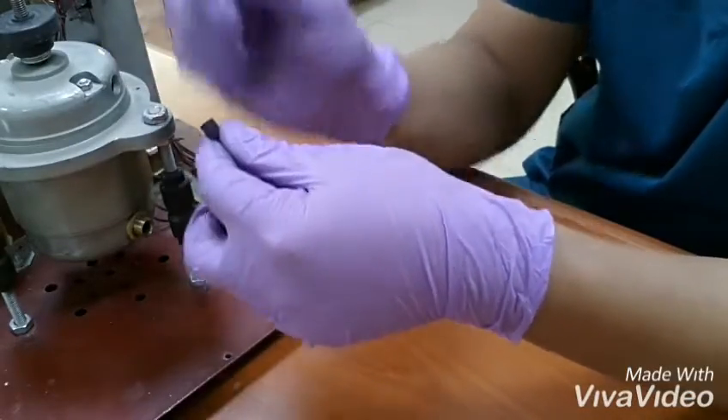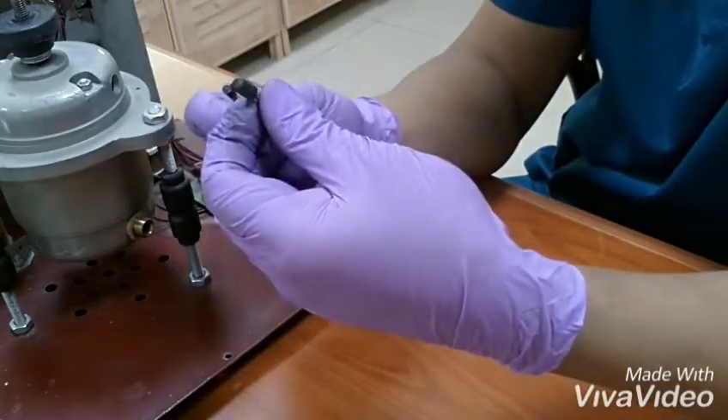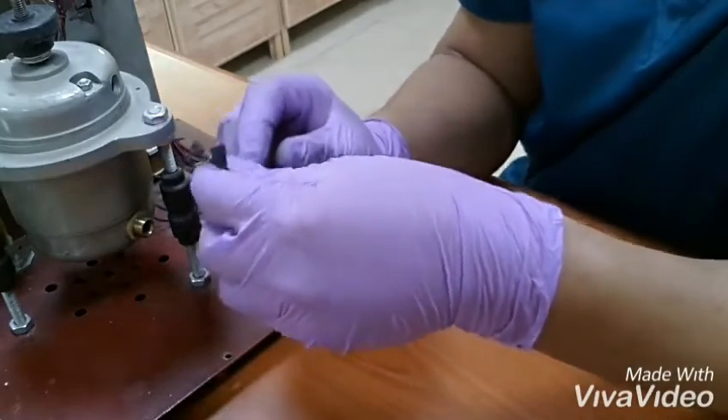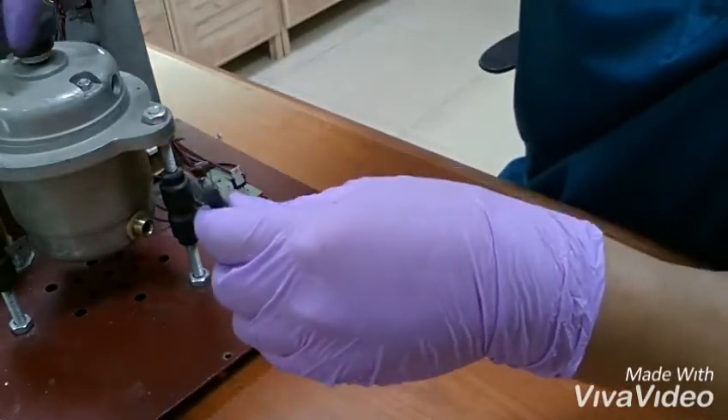So we will try to change this carbon brush, and let's see if the machine is working.